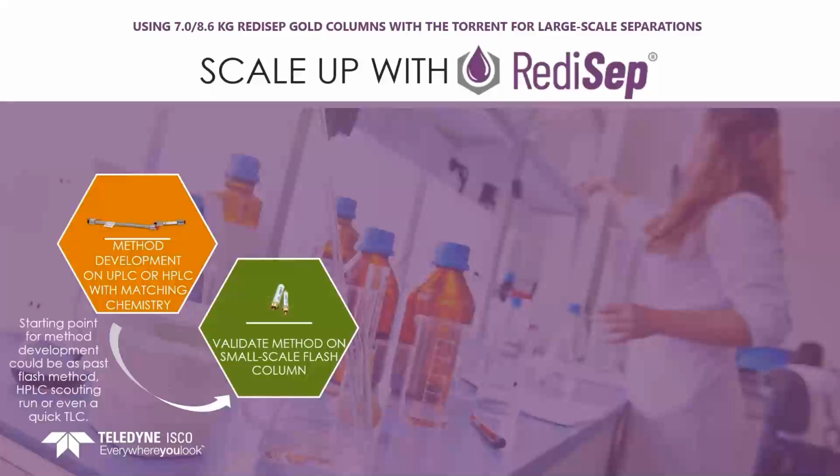And so the starting point for method development could be either a past flash method that we've run, maybe on a 4-gram, 12-gram, or 24-gram column, and then you could just go ahead and scale that up. Or we could do an HPLC scouting run, or even a quick TLC to give us a starting point. Once we're happy with the method, we think we found a method that will work, we want to validate that method on the flash scale, particularly if you're coming from HPLC. Make sure everything translates when we go to the flash media.